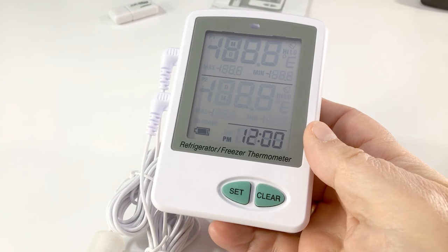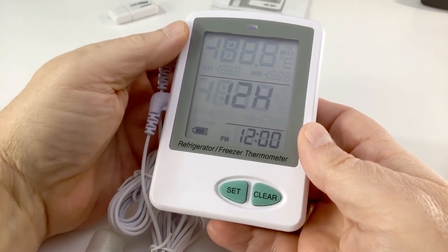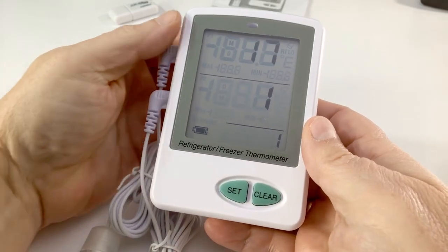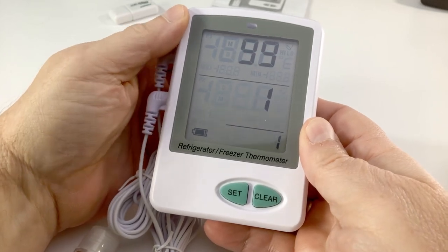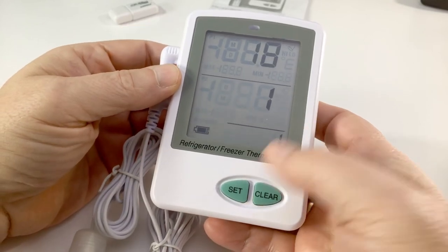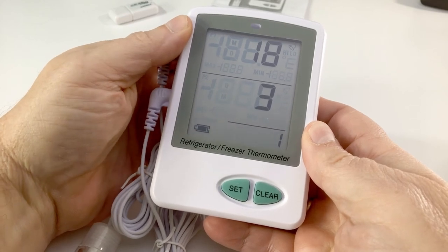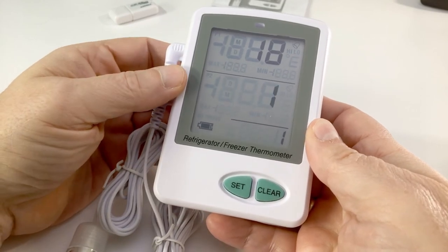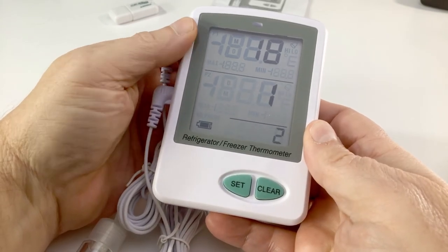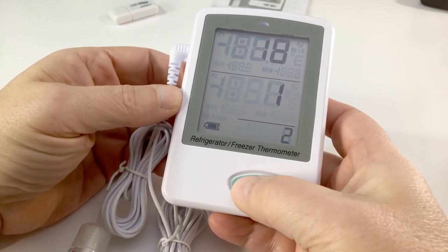12H stands for 12-hour format. You have two choices: 12 or 24. I choose 12-hour format and press the Set button to make my selection. Next is the year — use the up and down arrow keys to scroll through choices. I choose 2018 and press Set. For the month, scroll up or down — it is January, press Set. For today's date, scroll to the second and press Set to make the selection.